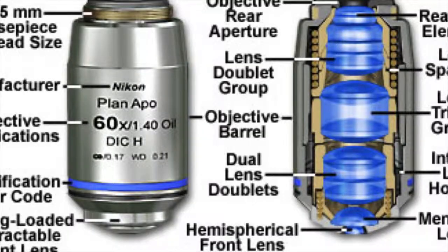In order to achieve the actual numerical aperture that's printed on the objective, your microscope must be perfectly aligned. The condenser that we talked about has to be in the perfect vertical position. We're going to cover all this in detail. But you cannot just throw a specimen on the microscope, throw the objective in the light path, and get that maximum numerical aperture out of the objective if you're not doing all the steps that are required to achieve that. So numerical aperture is very important, and we'll talk about that more in a second.